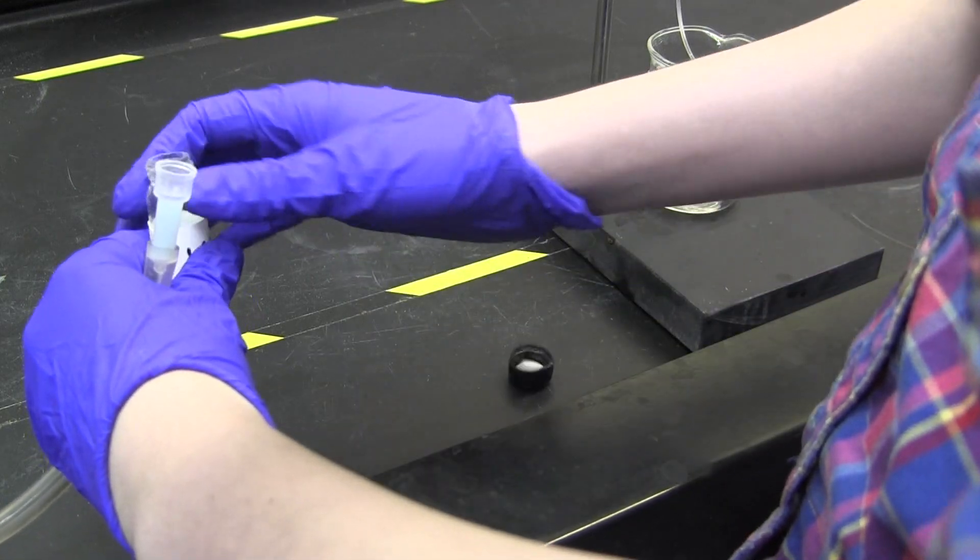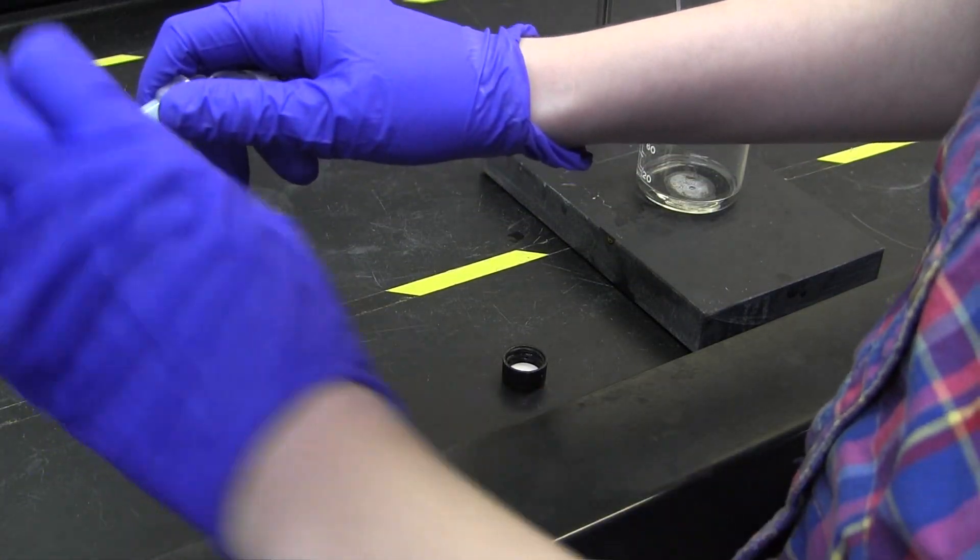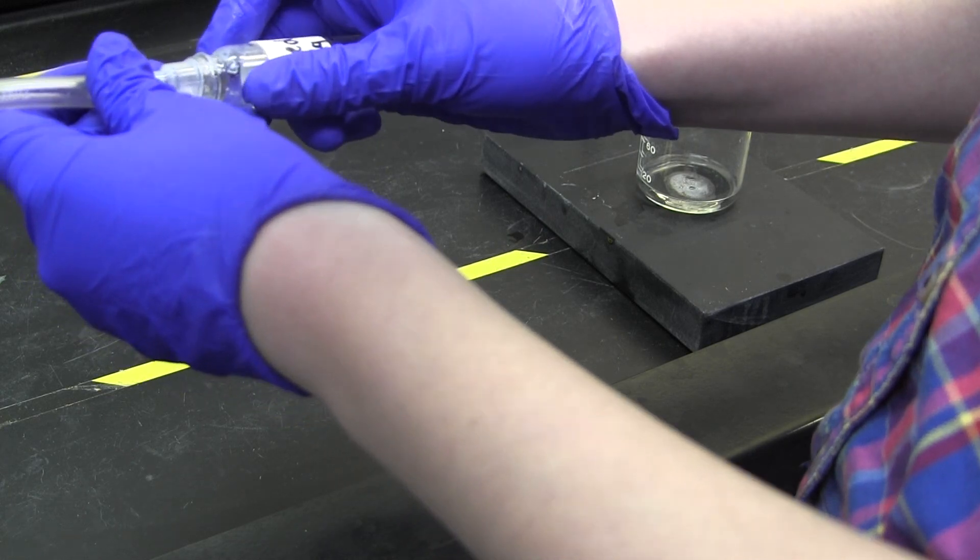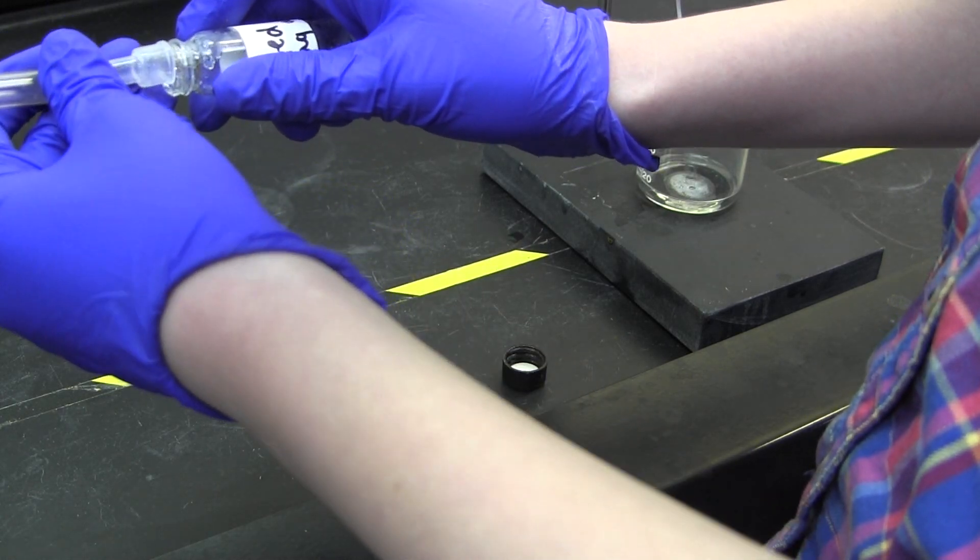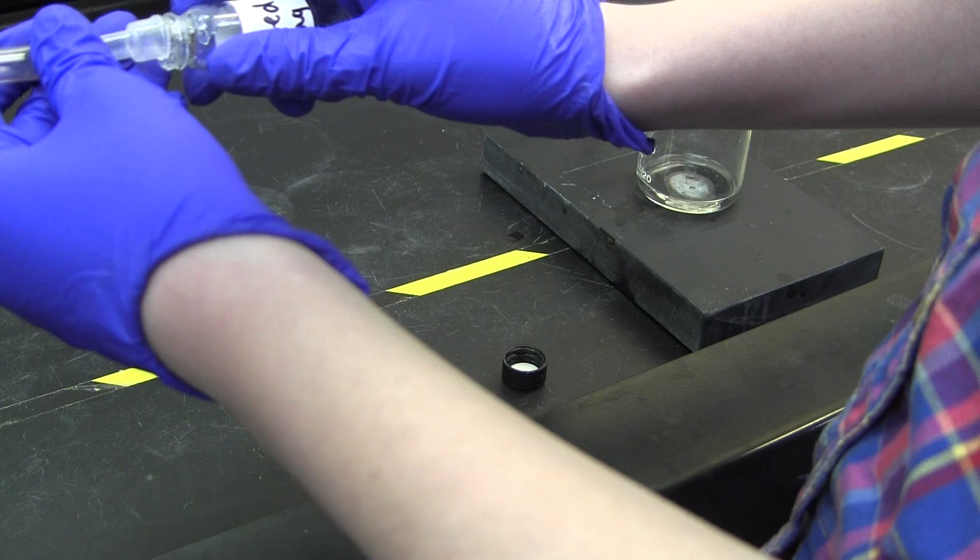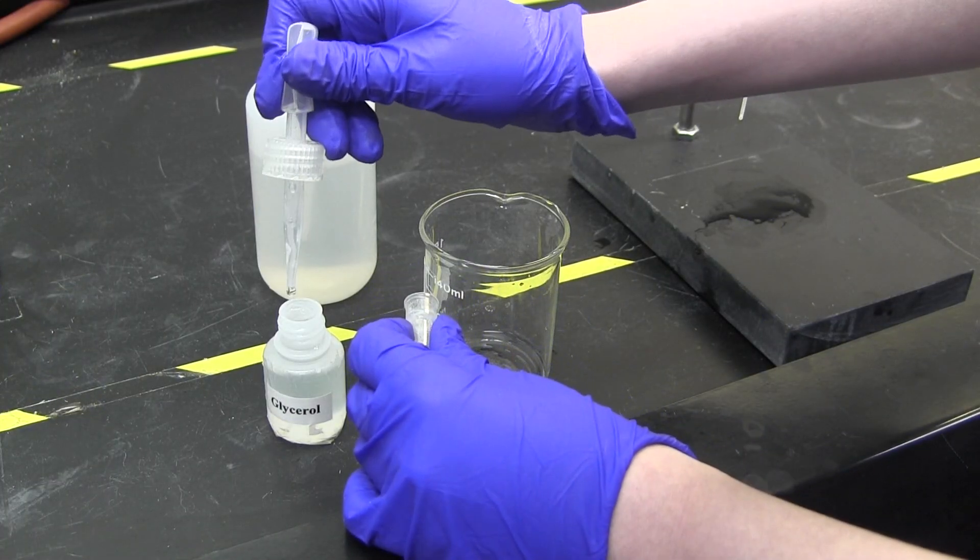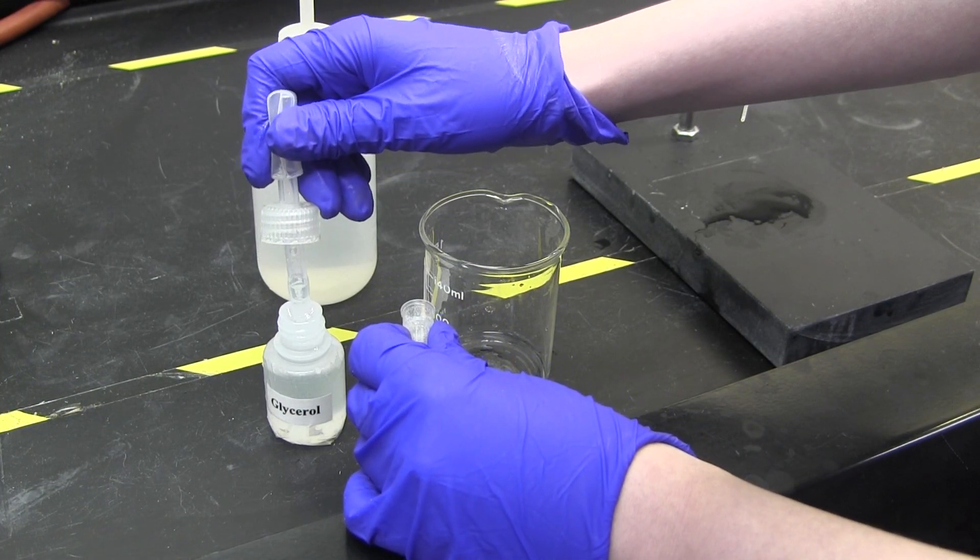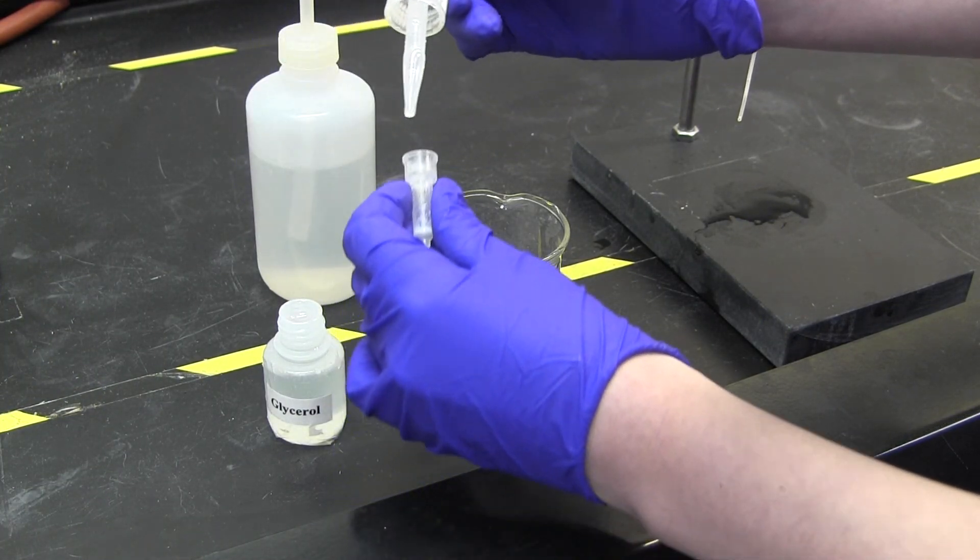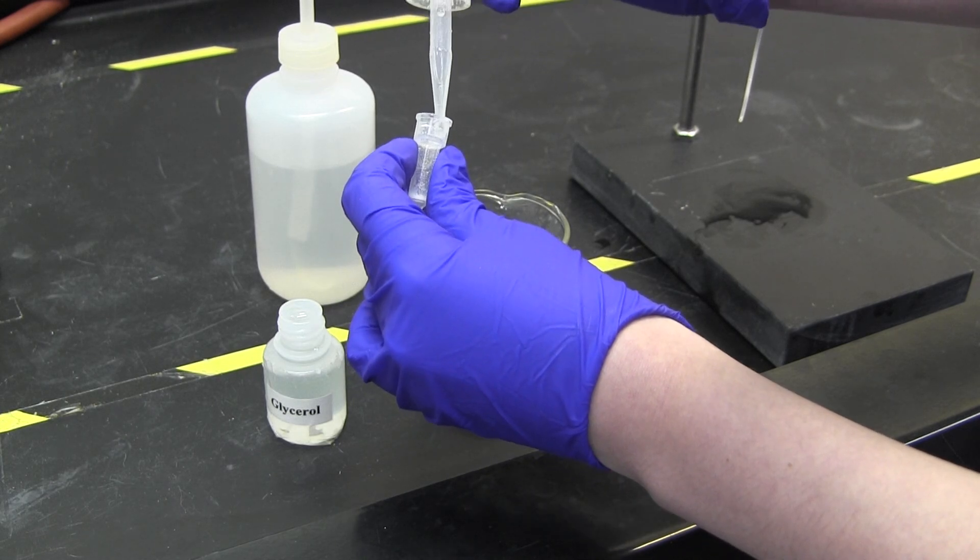Finally, clean your used column by blowing the resin into the appropriate color-coded waste container with nitrogen. Your TA will get the container for you, and it is very important that you use the correct one. Then, fill the column with glycerol and rinse it clean with deionized water. This will prepare the column for the next student. The glycerol will be provided by your TA.